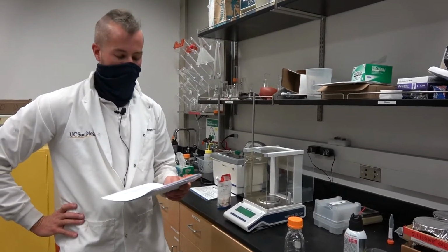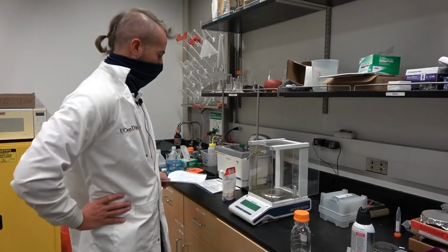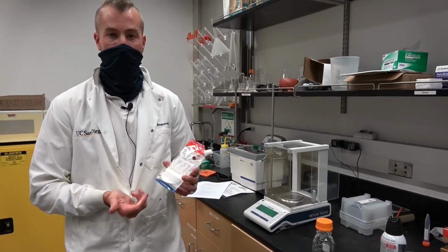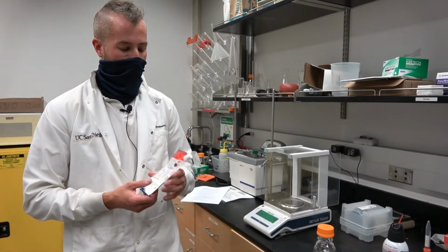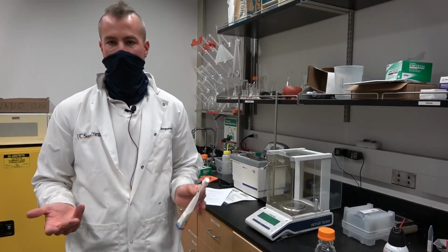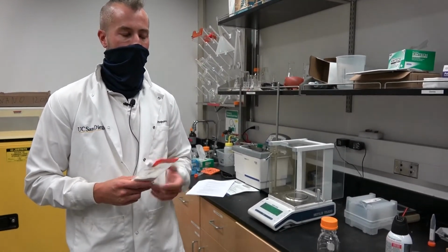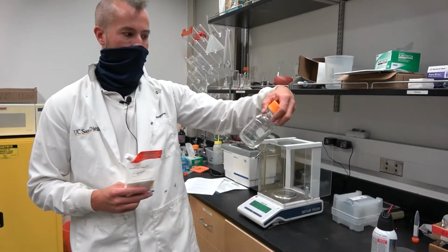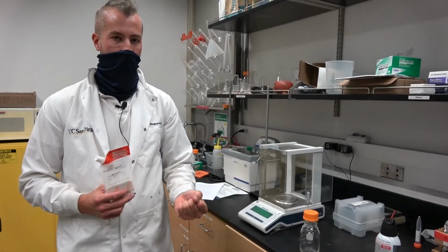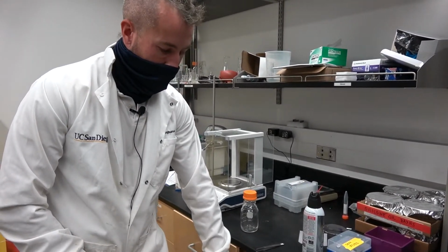Okay, so we're now on step 8 if you're following along on the protocol, and we need about 100 mils at 1%. Agar is kind of amazing stuff. It's made from seaweed, it's a sugar, and it's a powder that can be dissolved in liquid. It's not very soluble in water unless you boil it. When you boil it, it's completely soluble and just looks like thick water. But what's remarkable is that when it cools back down, it forms a solid, okay? So I think I told you we need 1%.